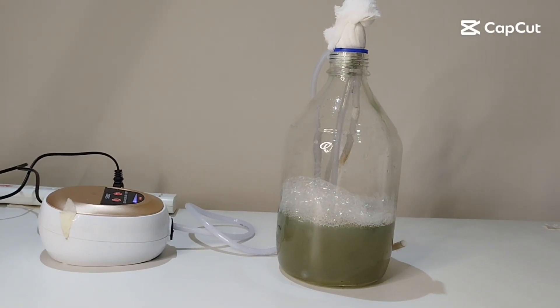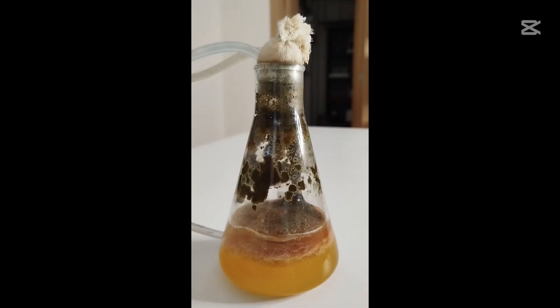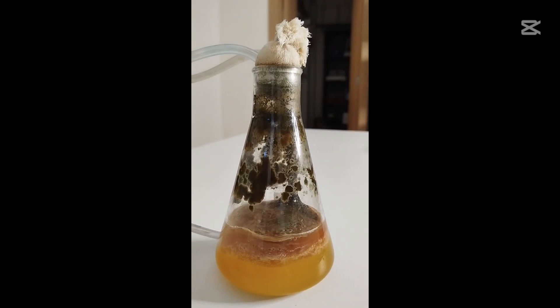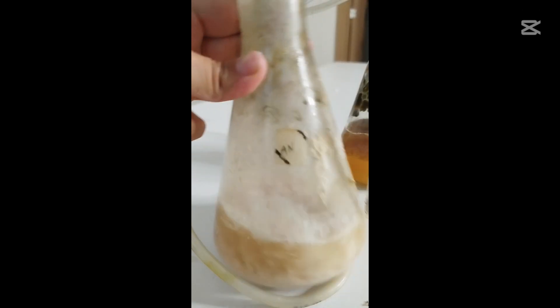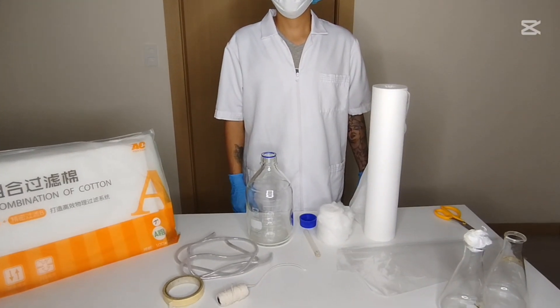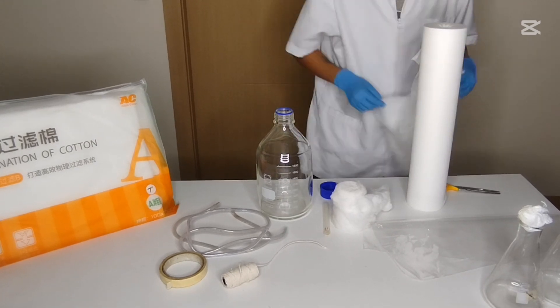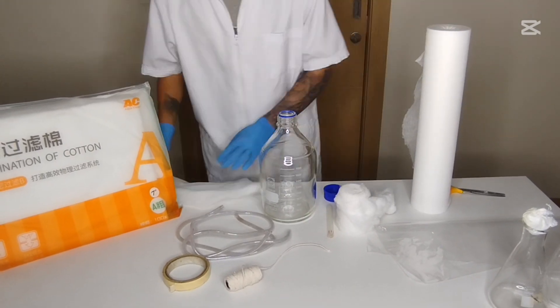DIY Bioreactor for Home — Grow Your Own Microbes. Building a simple bioreactor at home allows you to culture beneficial microbes like bacteria and fungi for gardening, composting, biofertilizers, or research projects. This guide explains the basic materials, setup, and process for creating a small-scale, easy-to-manage bioreactor without the need for expensive laboratory equipment.